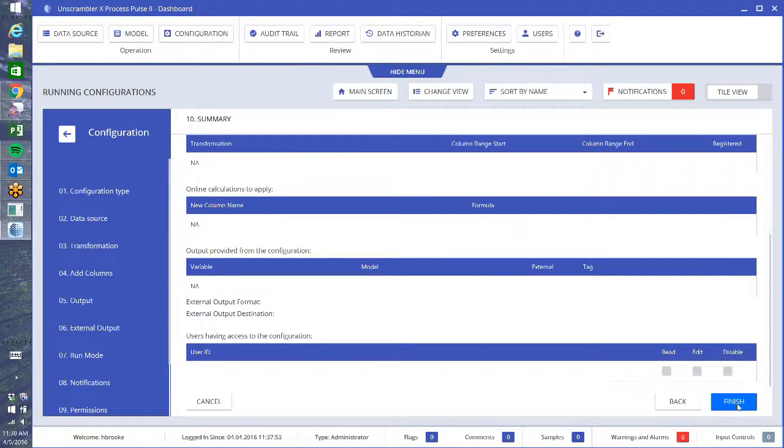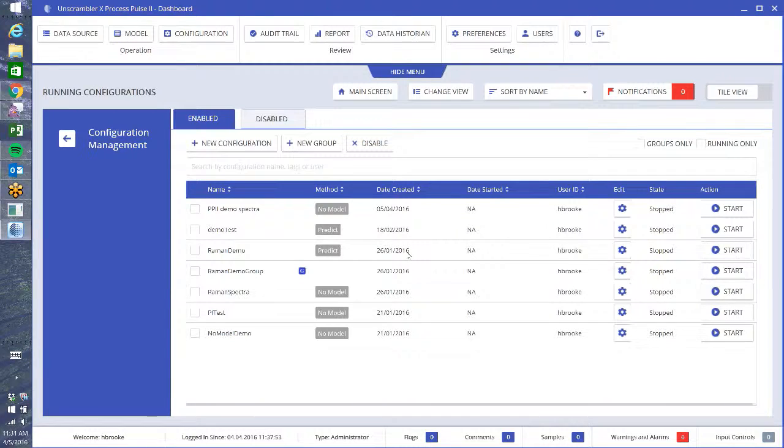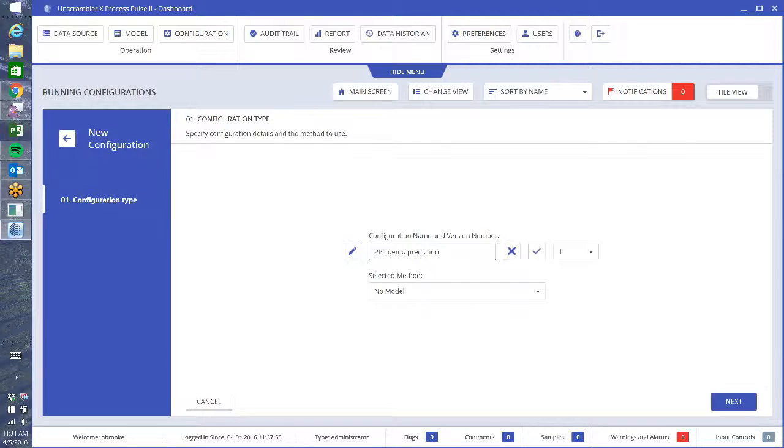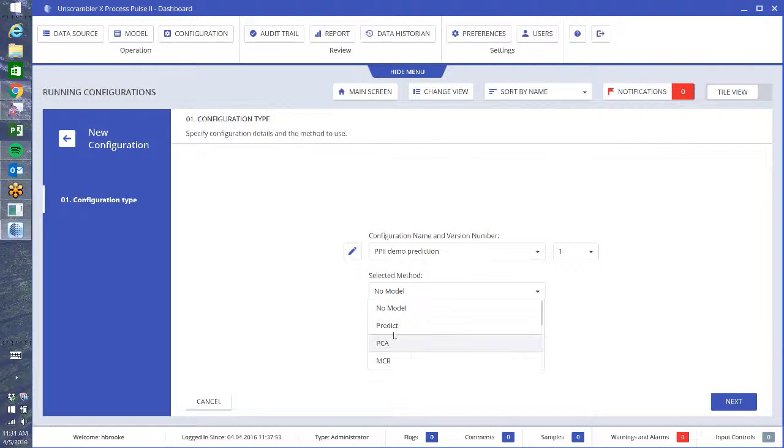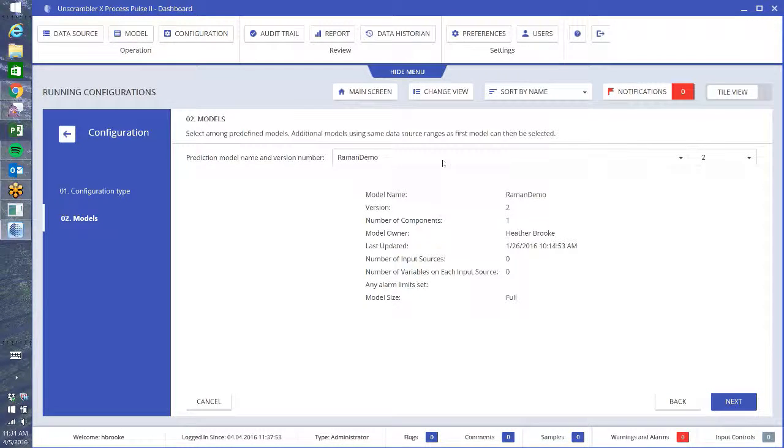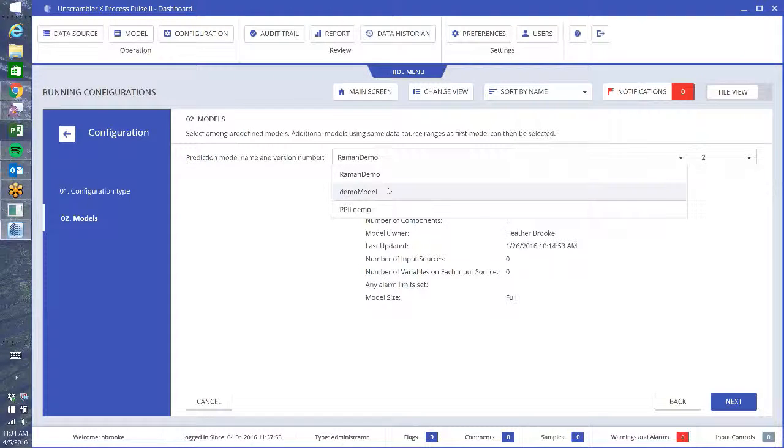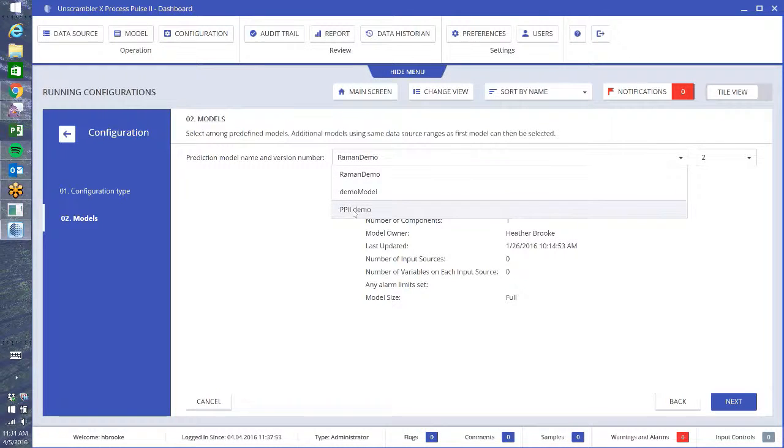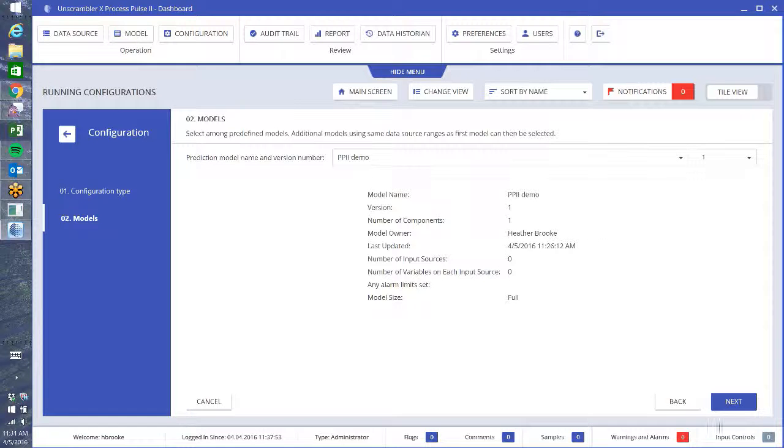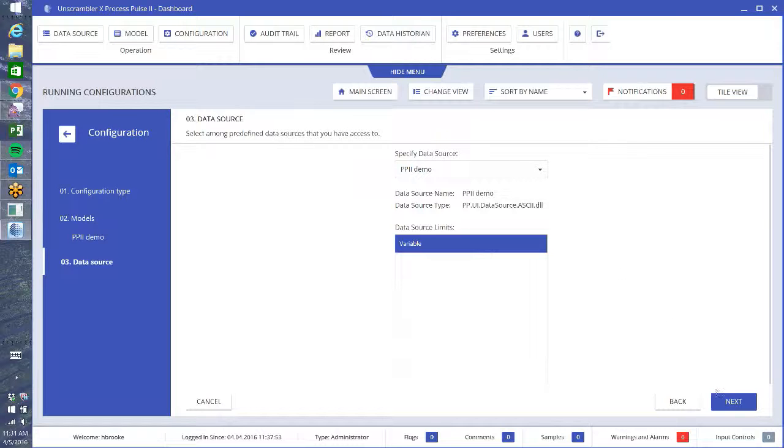I'm going to do one more. So I want to do edit, Process Pulse 2 Demo Prediction, say OK, and I'm going to do a prediction model. Hit next. Now I get a couple more options, so now I can go into my models that are available and I'm going to choose Process Pulse 2 Demo. It gives me a summary so I can make sure that is the one that I want to use. Next, I choose my data source again.